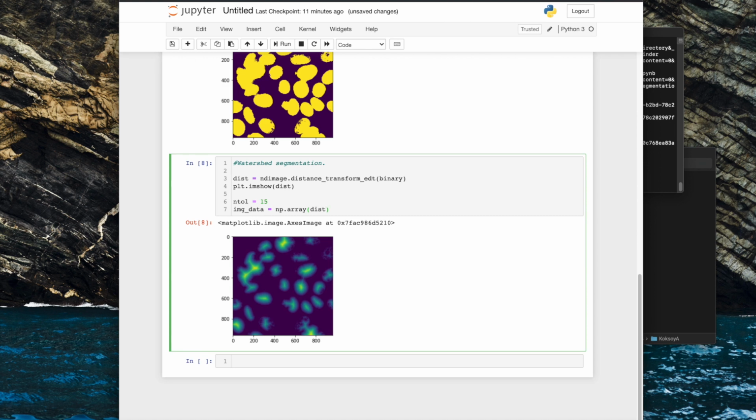And then I want to make sure that the input of the Find-maxima algorithm is scaled between 0 and 255. It's designed to work fast, and as part of that, the processing is done on an image between those limits.